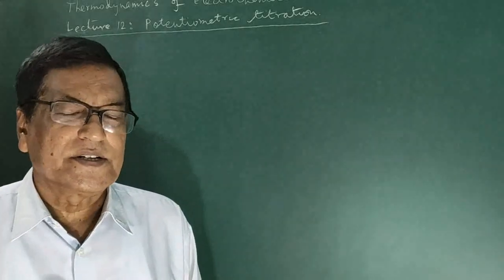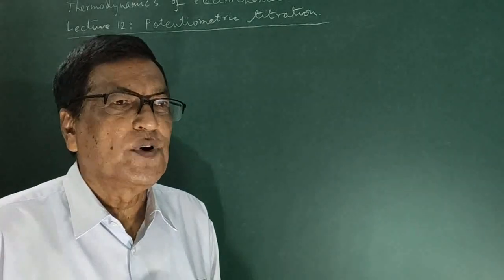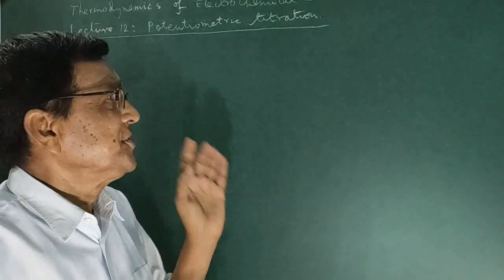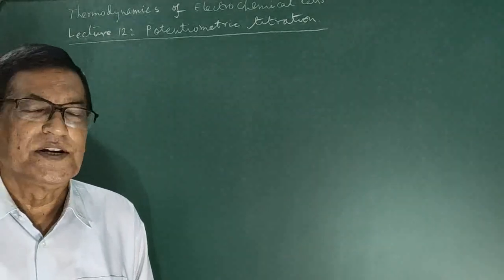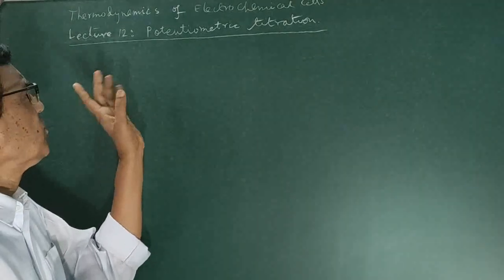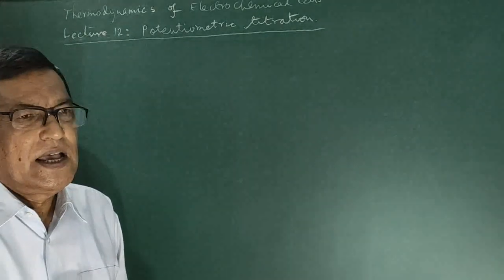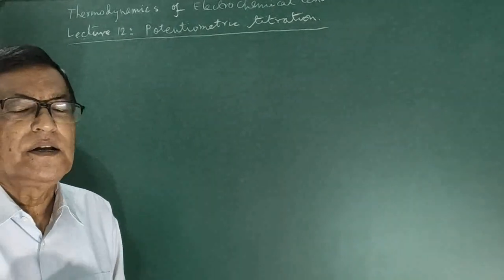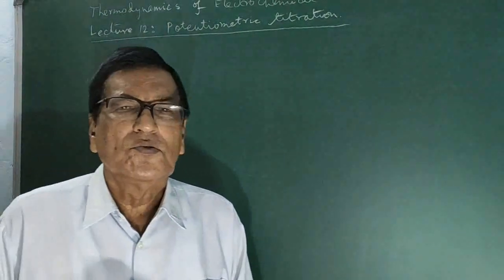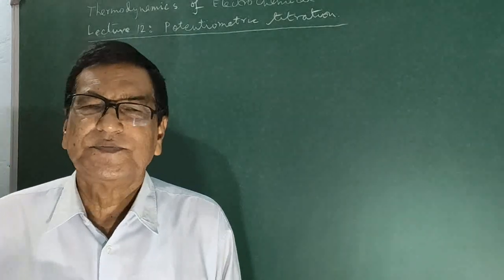Let us start the last or almost last but one chapter in this series of lectures on thermodynamics of electrochemical cells, lecture 12. It is a potentiometric titration. Before going to this potentiometric titration, I like to explain what is meant by titration.